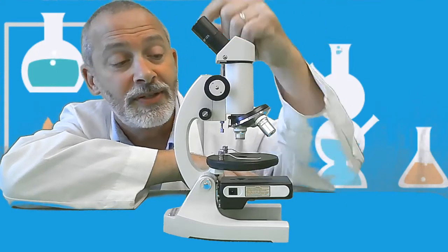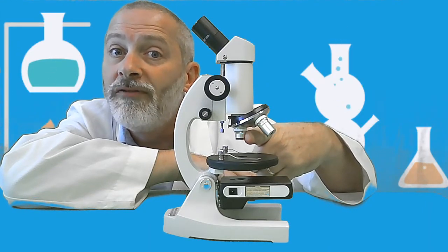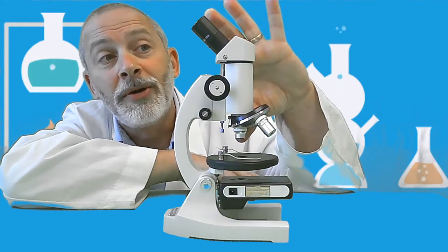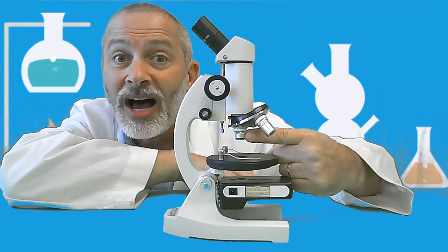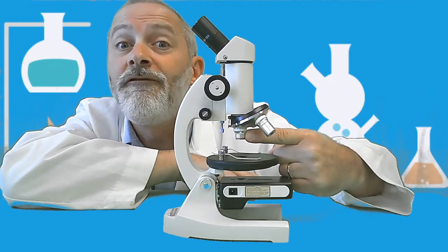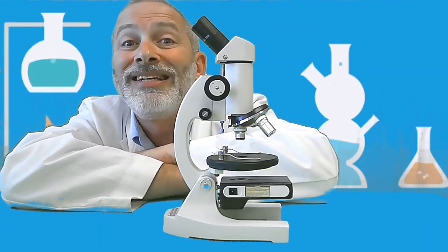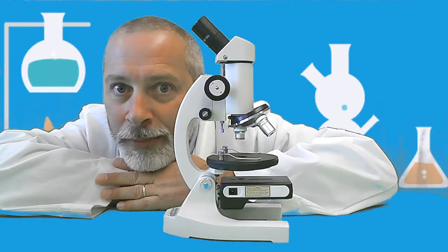So let me give you, for instance, the low power objective lens has a magnification power of 4. So if you're looking through both the eyepiece and the low power objective lens, you're going to multiply 10 times 4. So what is 10 times 4 equal to? 40. So when using the low power objective lens, whatever you're looking at is 40 times larger than in real life.